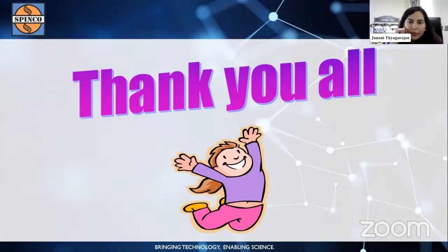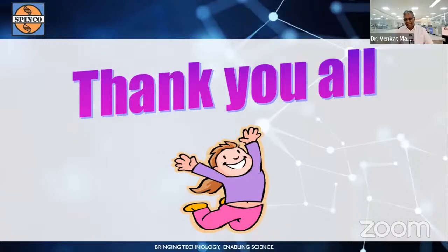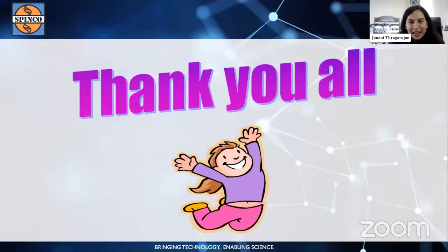Which technique is best for quantitative analysis, LC-MS-MS or GC-MS-MS? Mr. Ram Singh has asked us this. Next question. It is very difficult to answer. This is not the right question, because that depends on the sample and the sensitivity that you want.